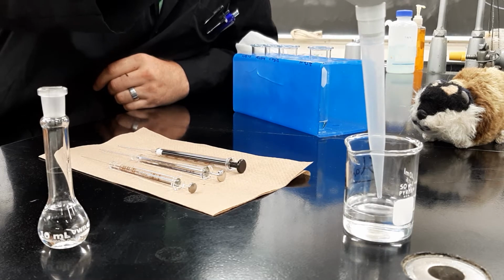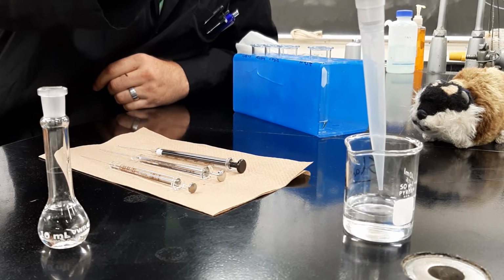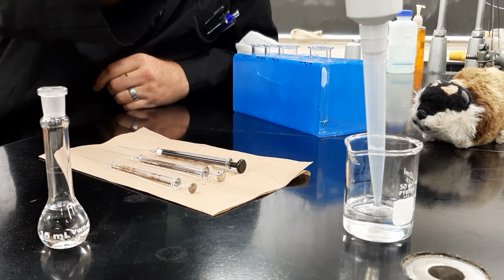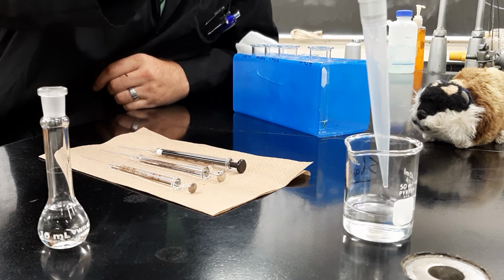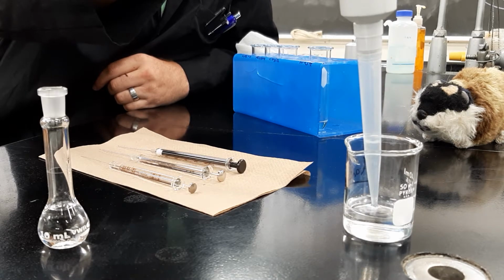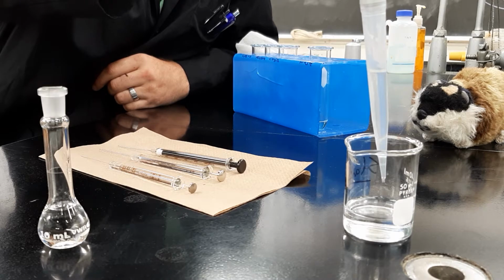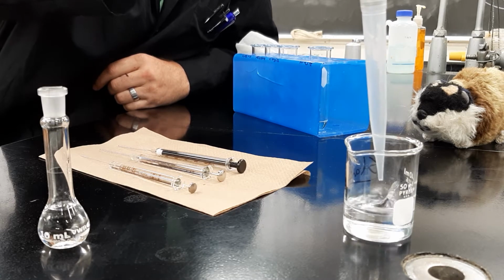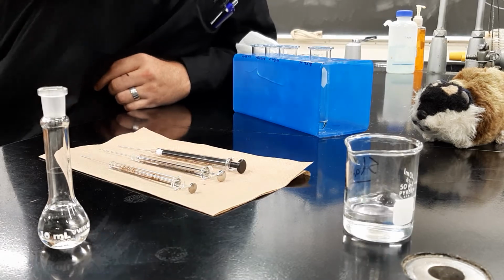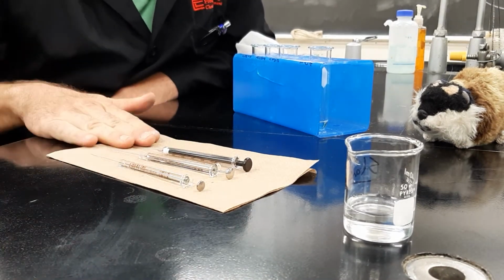You can draw it up and put it out repeatedly, and that'll cool the tip. And I found that can work okay for accurate delivery of volumes. Then it doesn't drip out quite as fast. But really, and there's some positive displacement techniques as well, but really for a lot of things you need to go ahead and switch to volumetric syringes.